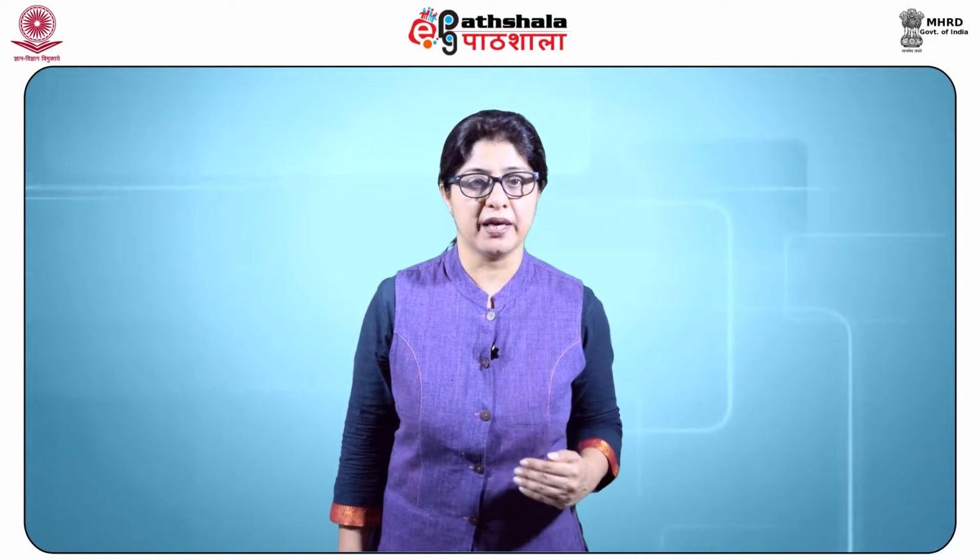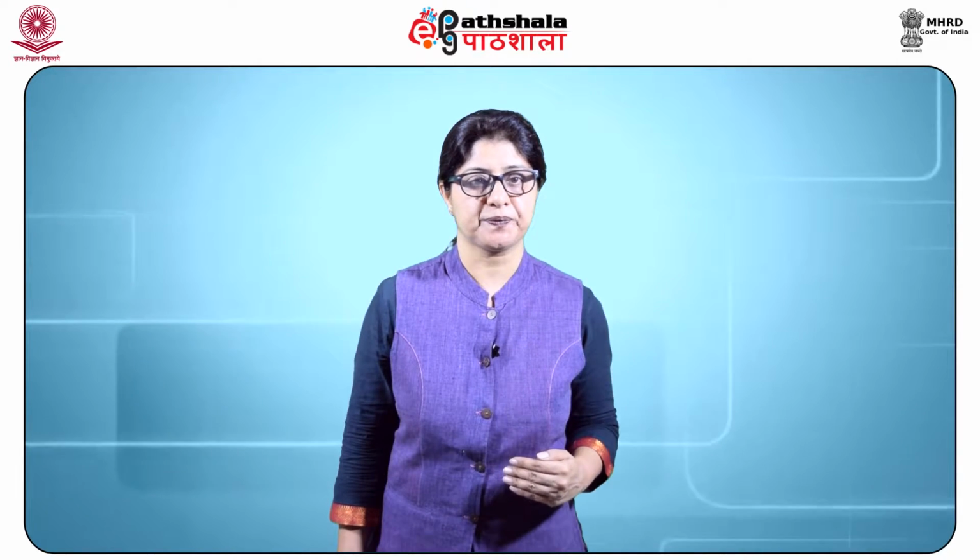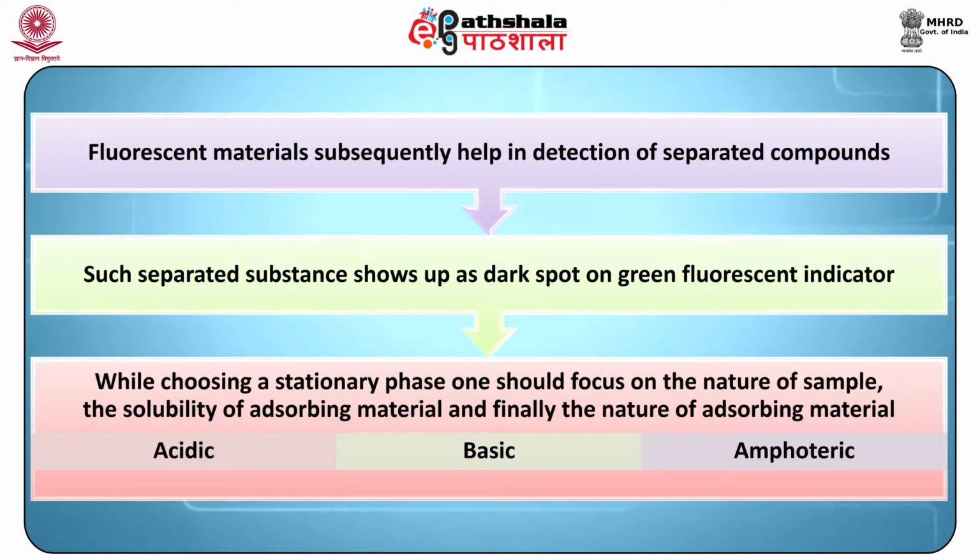Normal phase or straight phase adsorption TLC on silica gel with a less polar mobile phase such as chloroform-methanol is the most frequently used mode. In real practice, thin layer chromatography utilizes inert fluorescent ingredients such as zinc silicate in the coating materials, and the addition of these substances does not change the chromatographic characteristics of an adsorbent. These fluorescent materials subsequently help in the detection of the separated compounds. Such separated substances show up as dark spots on the green fluorescent indicator.